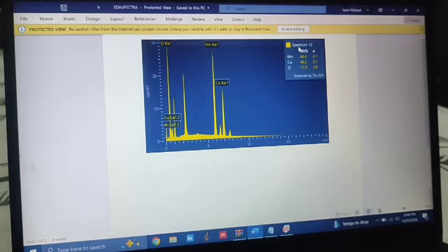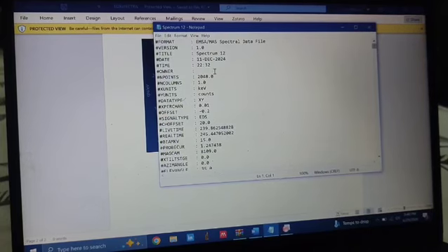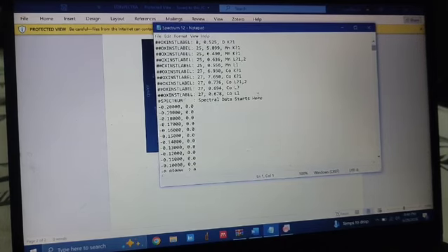Now, first open your raw data file along with the instrument generated graph. In the graph, you will notice a label such as spectrum 12 or something similar. Now go back to the raw data and locate the data corresponding to that specific spectrum. Now, once you find it, copy that data.